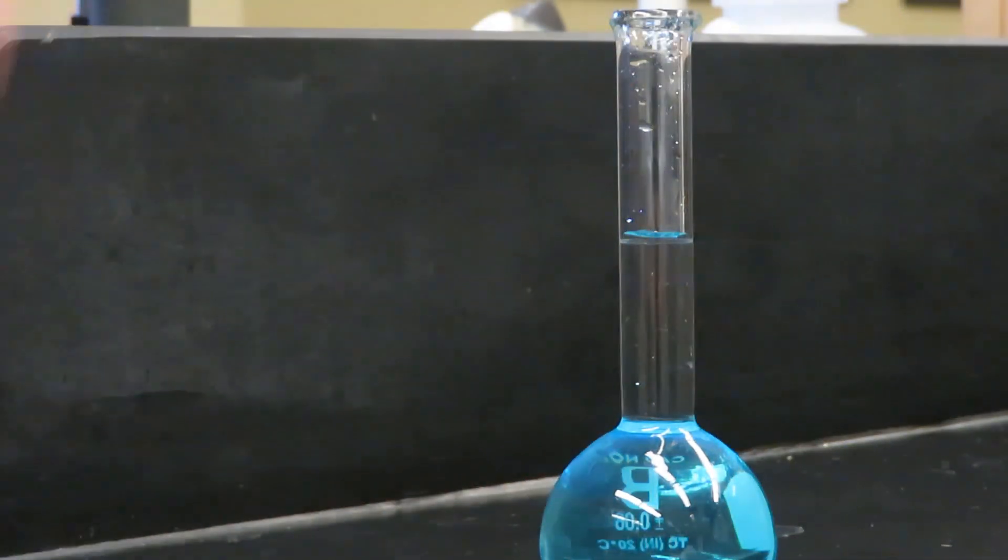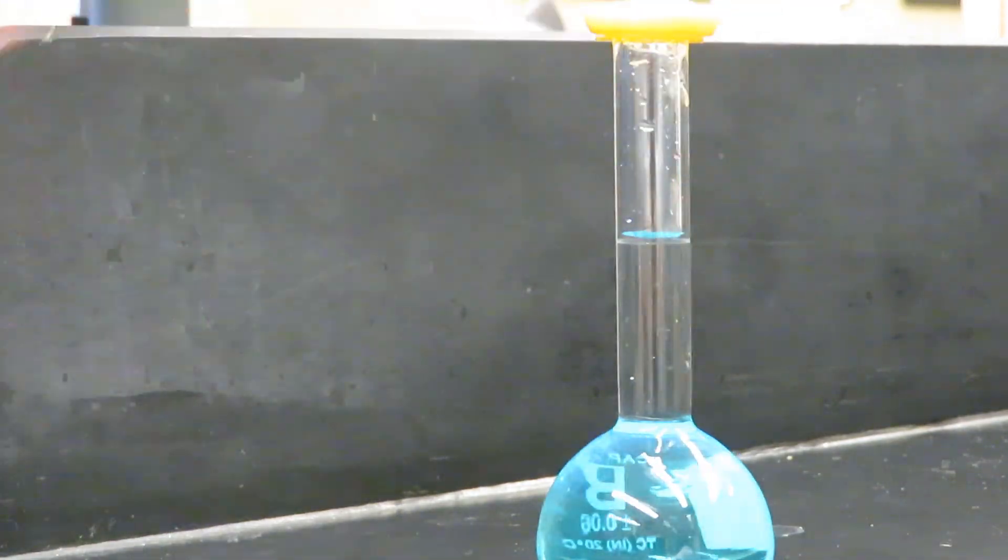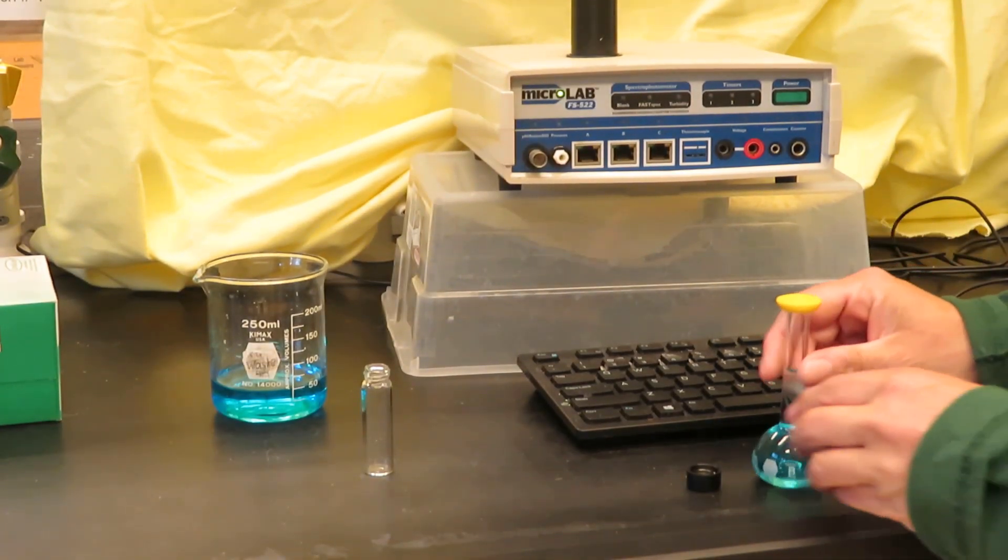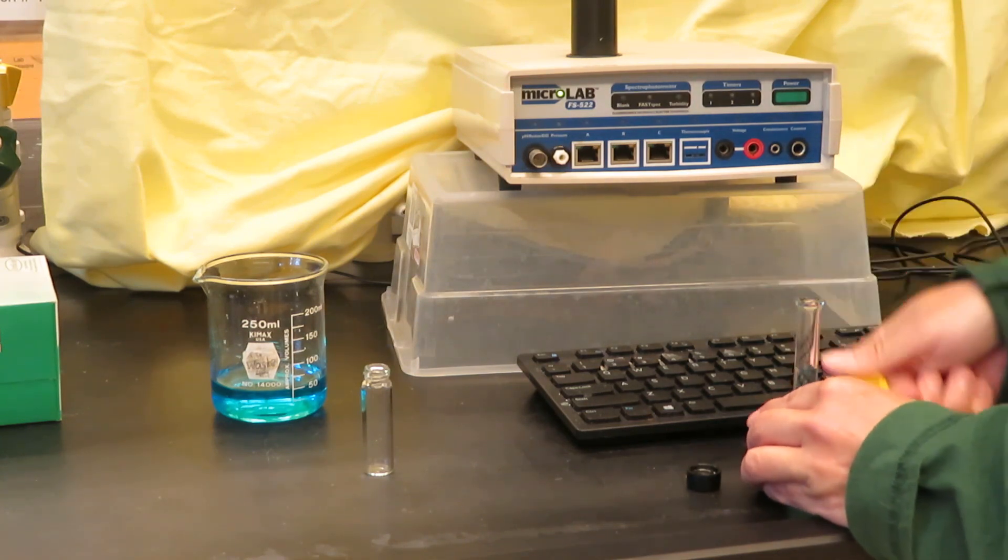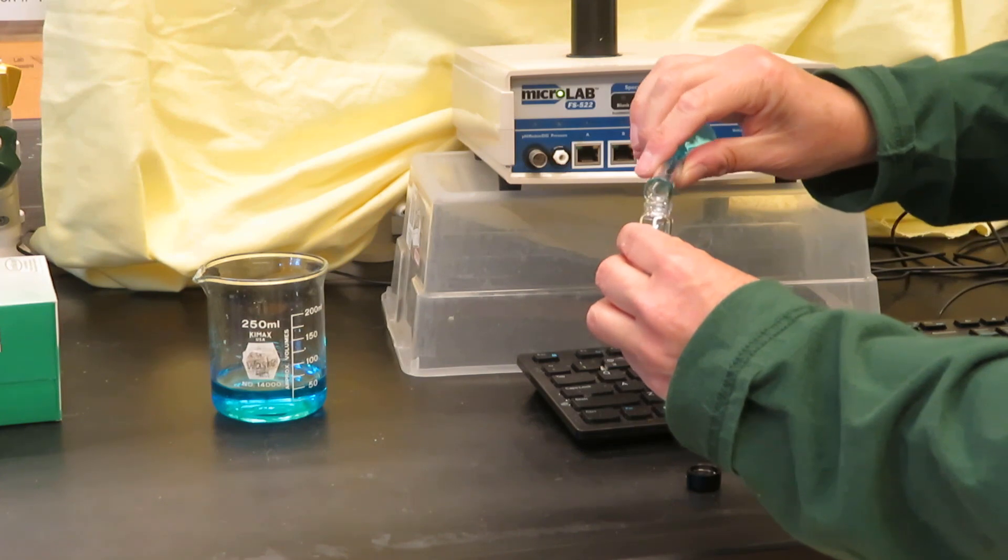Now I can finish mixing and we'll be ready to measure the concentration. We have our unknown solution that we made from Part B from a solid. We want to transfer it to the vial to measure the concentration of the unknown that we made.